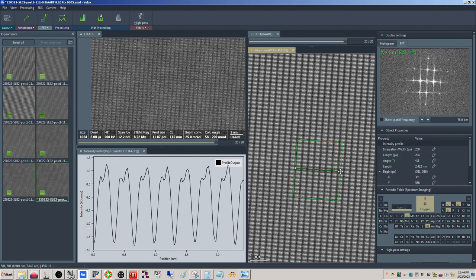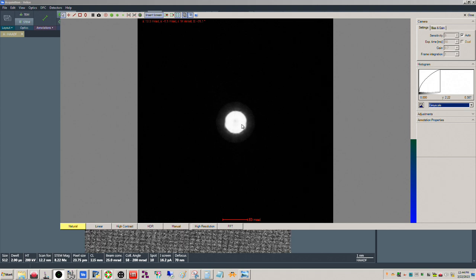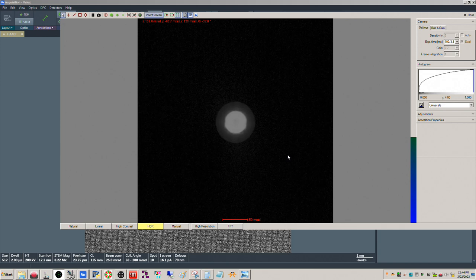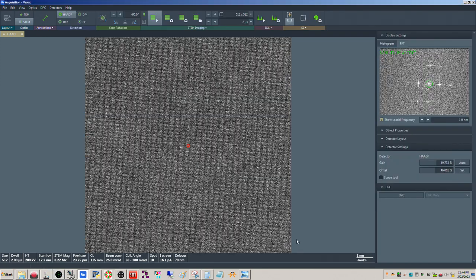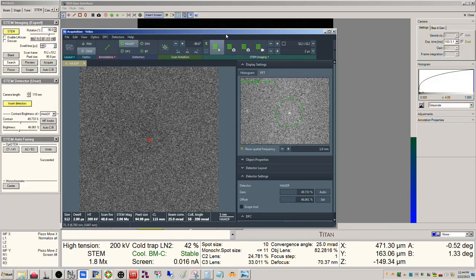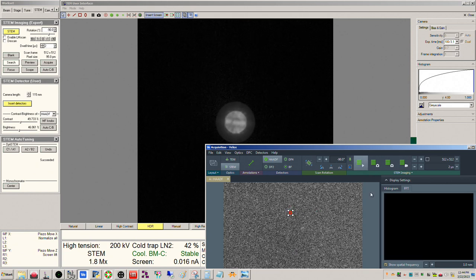So now it's possible that we could try running the auto tuning again here, actually, the A2, B2, just to make sure. Because you can see these are a little asymmetric, so that may mean a few things. It may mean that our zone axis is a little bit off, but I don't think so. I think it looks good. This looks maybe a little bit closer up there.